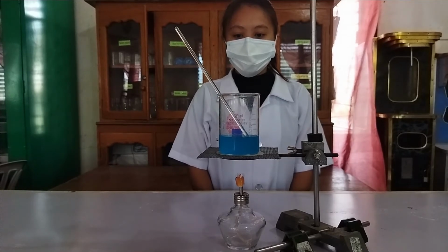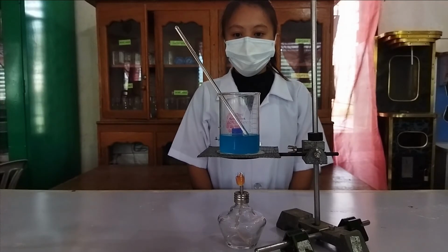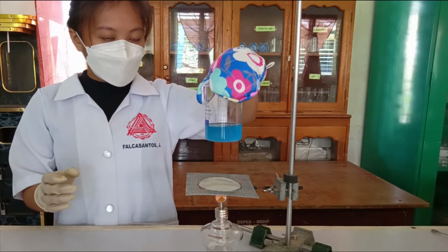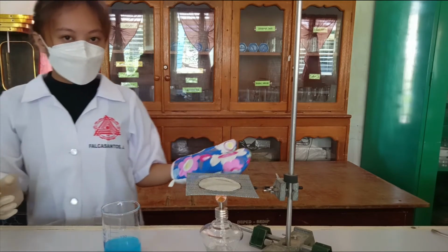You can also place a second supporting ring around the top of the beaker or flask to prevent it from being accidentally knocked off. Again, remember to protect your hands from being burned by using a rag or heat-resistant gloves when touching the beaker or flask.